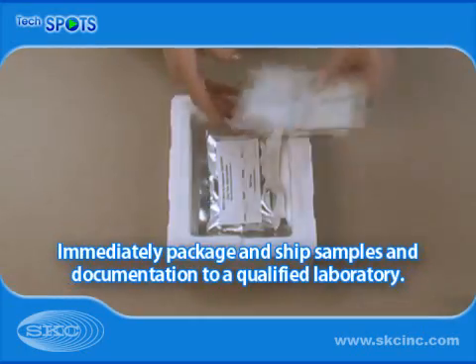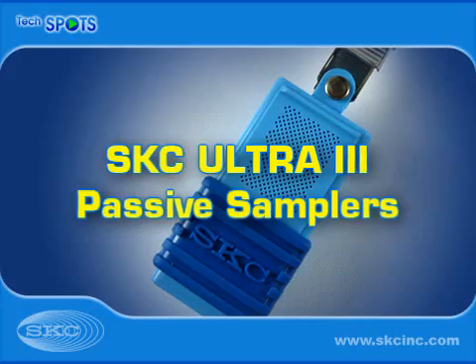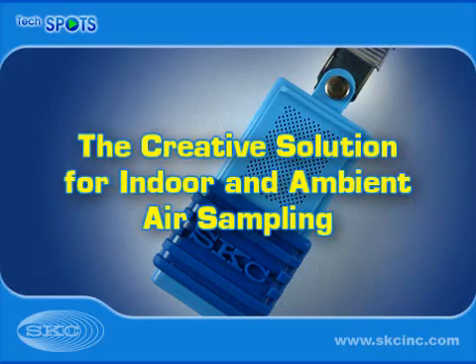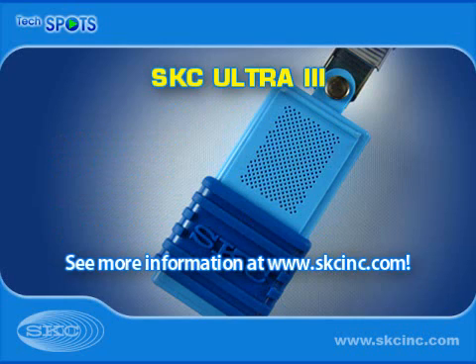Immediately package and ship samples and documentation to a qualified laboratory for analysis. SKC Ultra-3 Passive Samplers are the creative solution for indoor and ambient air sampling, with many advantages for sampling VOCs, SVOCs, and more.